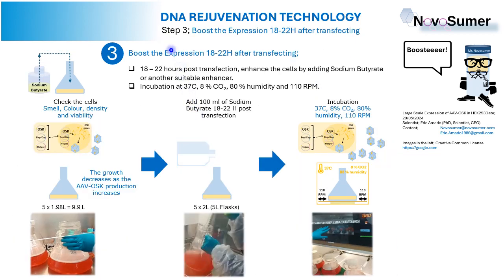Well, step number 3, boost the expression 18 to 22 hours after transfecting. That means help the expression by the addition of a booster. Very easy step. Okay, so boost the expression 18 to 22 hours after transfecting.